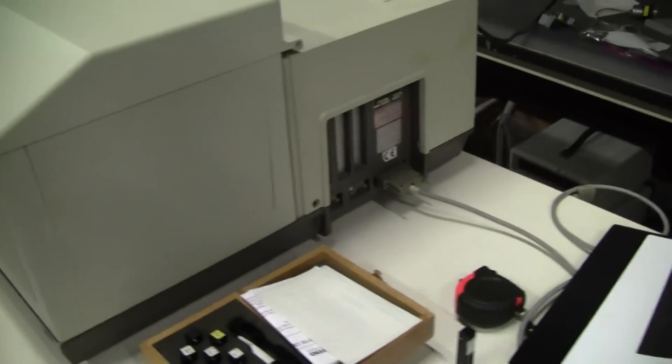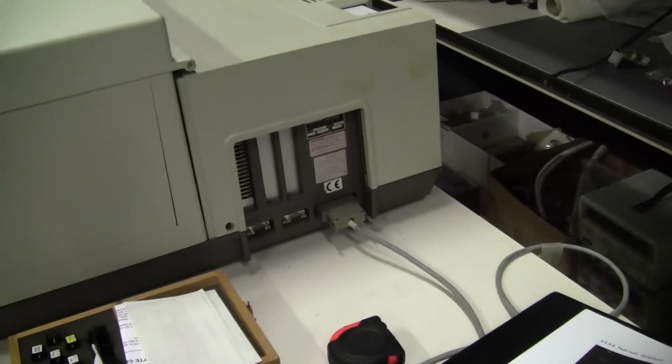This particular spectrophotometer has an integrating sphere, which I believe is 150mm. It's 250 volts, 60-50 hertz.